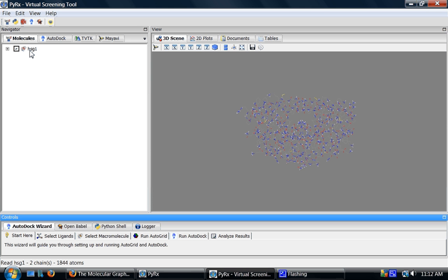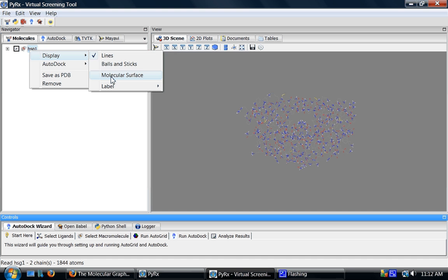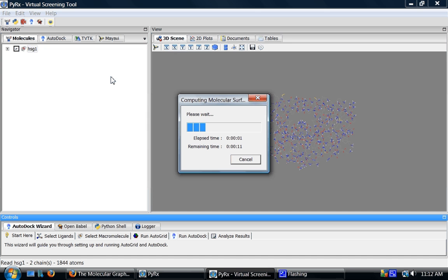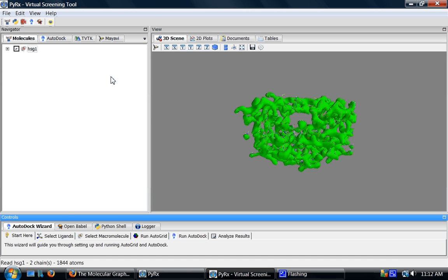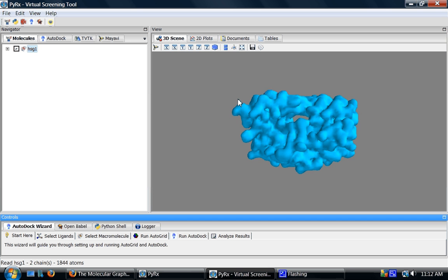Right click on this molecule and select display molecular surface. This computes molecular surface and shows the result here.